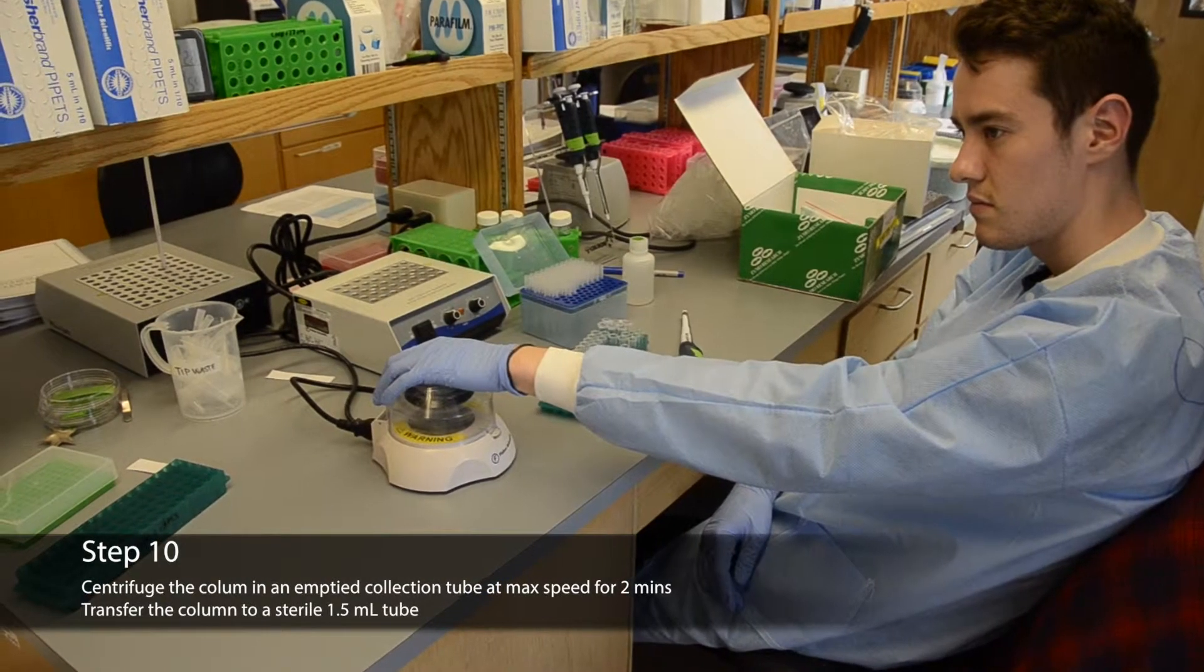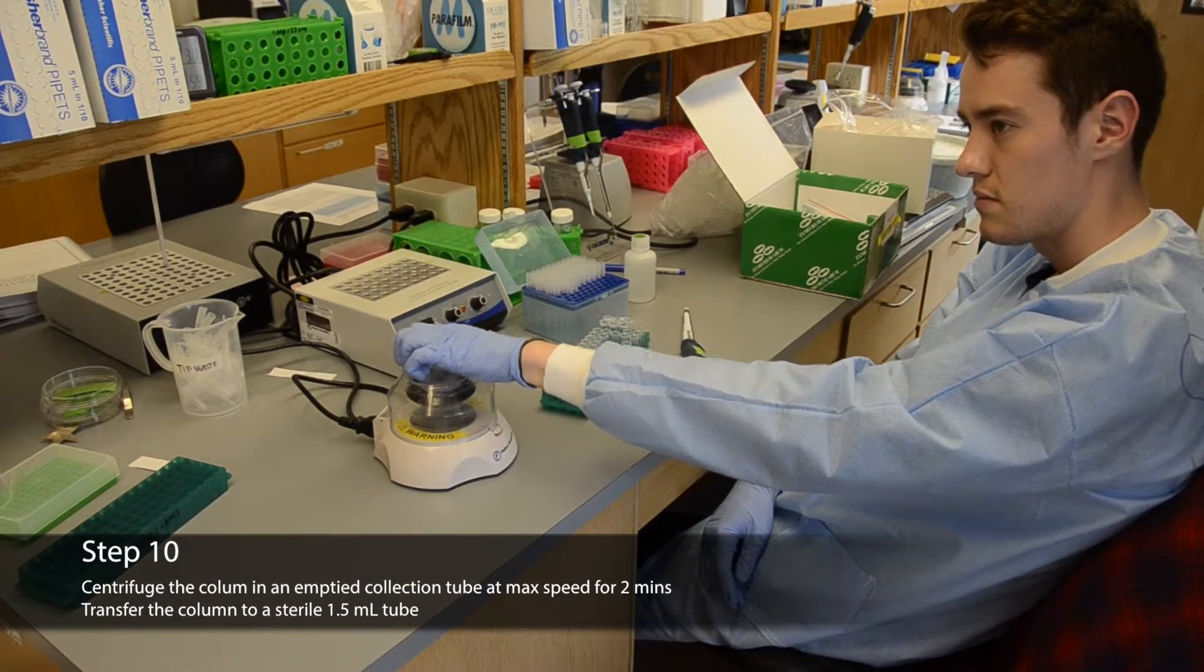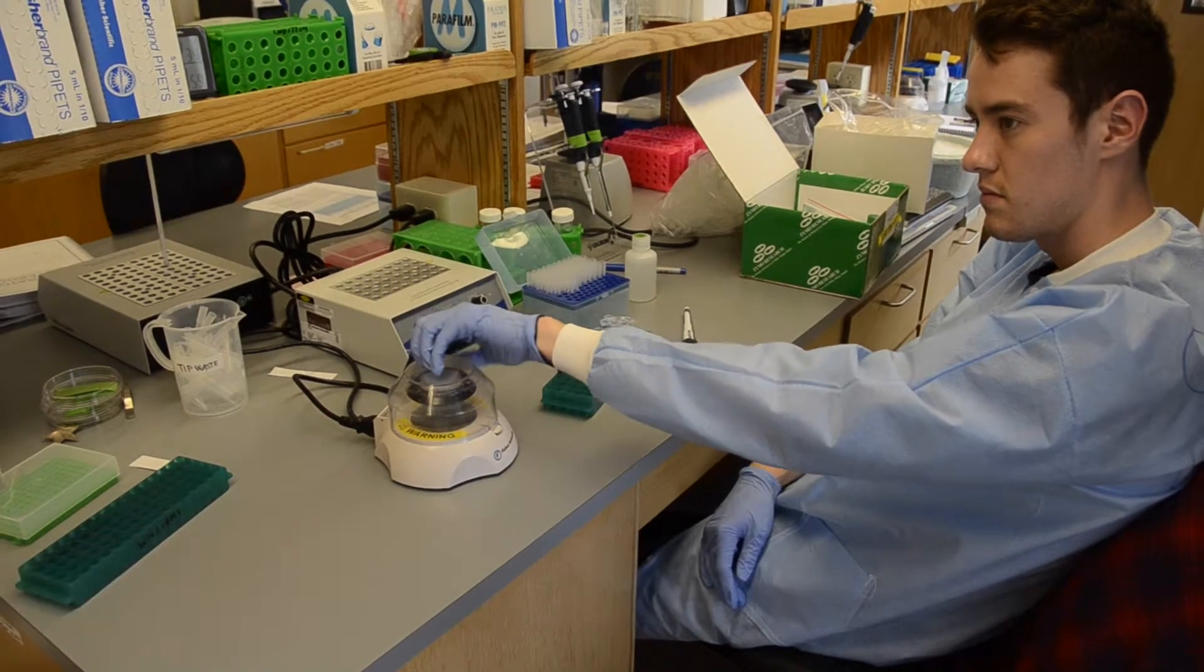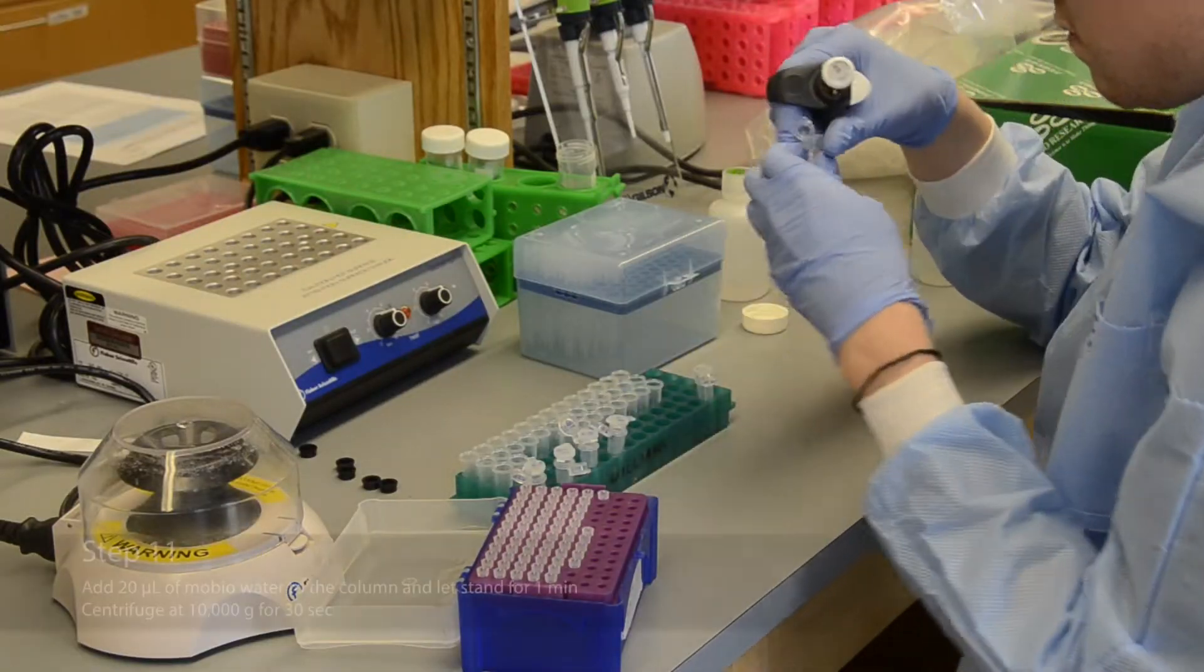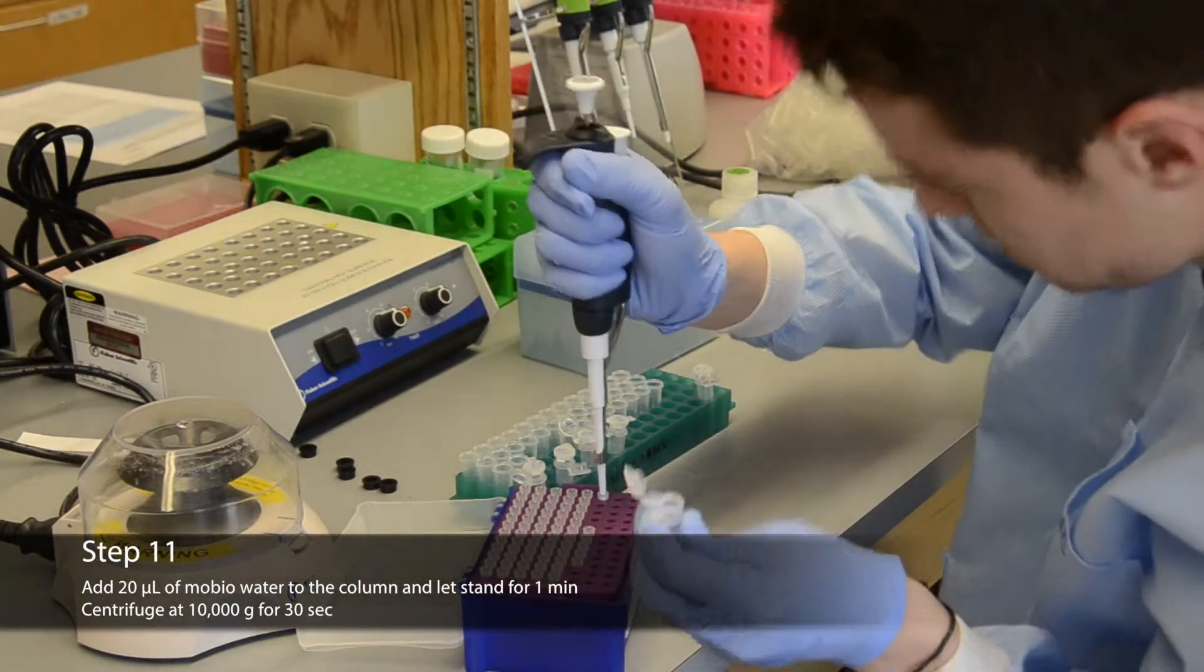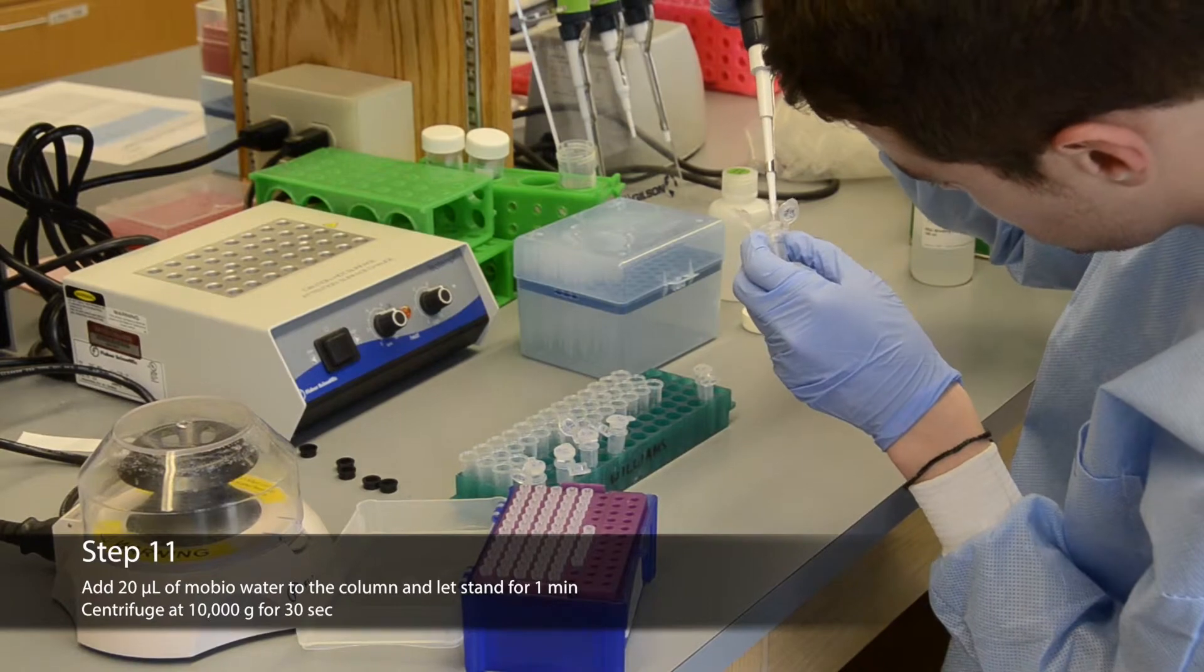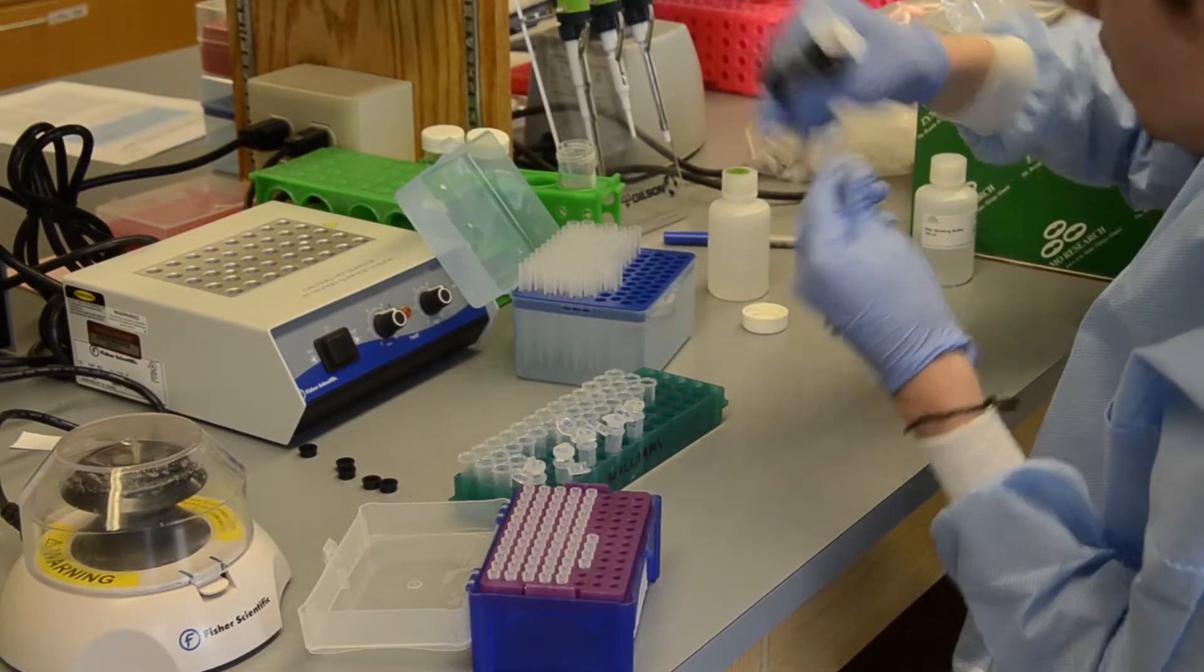Centrifuge the column in an emptied collection tube at max speed for two minutes. Remove the column and transfer it to a sterile 1.5 milliliter tube. Add 20 microliters of molecular biology water to the column and let stand for one minute. Centrifuge at 10,000 times G for 30 seconds.